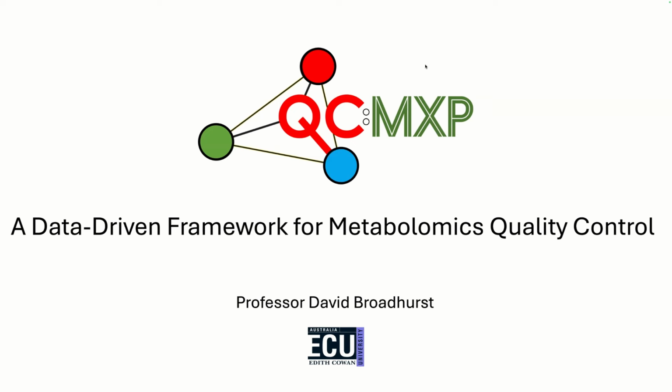Welcome everybody. My name is Rasmus Bro from University of Copenhagen, and we are very happy to have David Broadhurst here, even though it's quite late in Perth. David has worked with omics for many years, I guess you could call him a systems biologist, and today we're going to hear about how we can be sure what we're measuring.